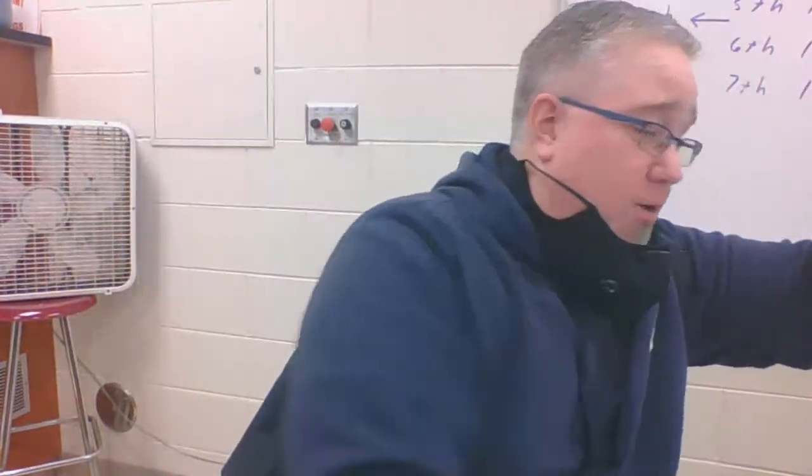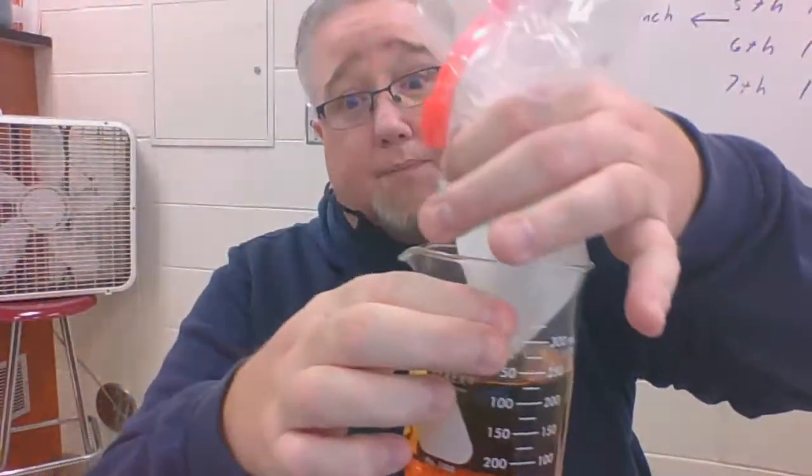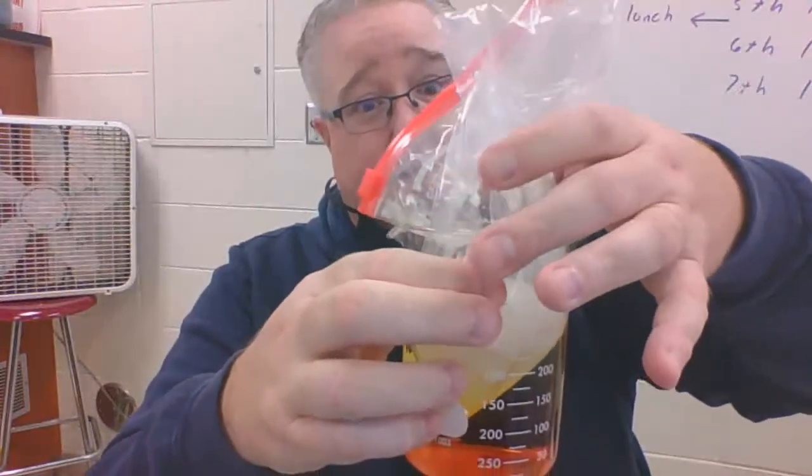Now that's not really the experiment. I just wanted to show you that iodine is an indicator. Okay, so what we're going to do is take our baggie that has our starch and water in it, and place it inside of our beaker of iodine and water. And we're just going to let it sit for a while. Usually it takes maybe an hour or two.